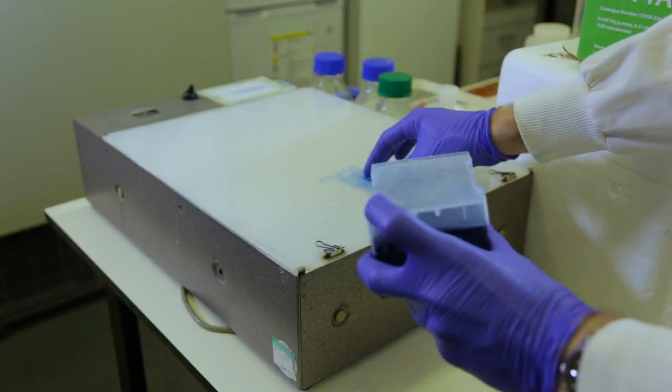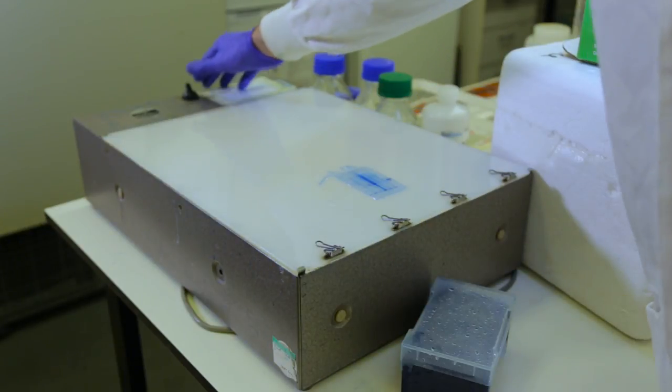So the destain is now finished, and we can now look at what we can see on our gel. Here we have the ladder. If we look in the next lane, we see the pre-IPTG sample, so this is before induction of the expression of our protein. This shows you all of the proteins that E. coli is producing. The next lane shows the post-induction sample, so this shows the expression of proteins after the addition of IPTG to our culture, and as you can see we have a nice band at about 30 kilodaltons corresponding to our protein.